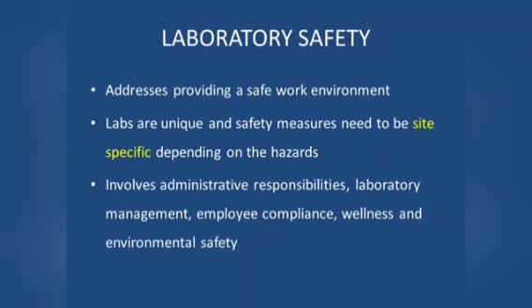Laboratory safety addresses providing a safe work environment. It must be site-specific. Labs may be unique and need safety measures according to the work being done in the laboratory.